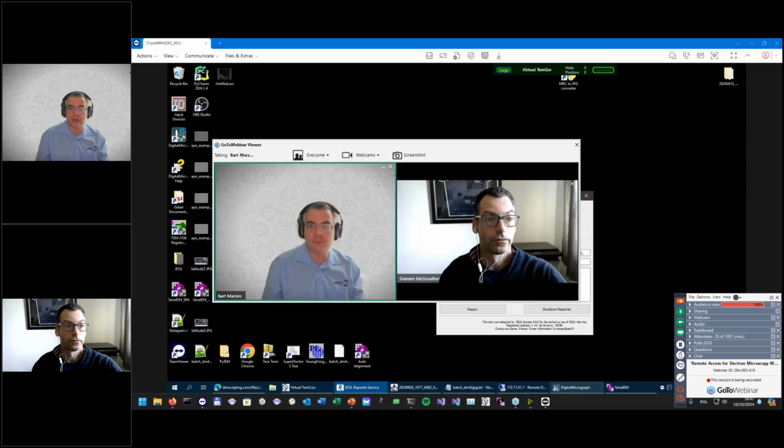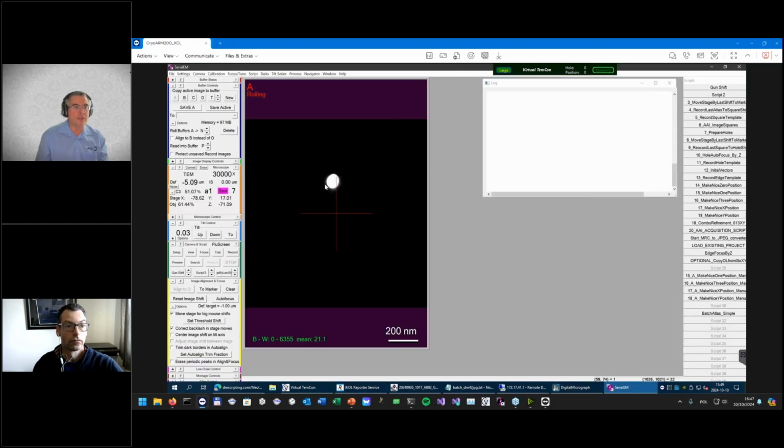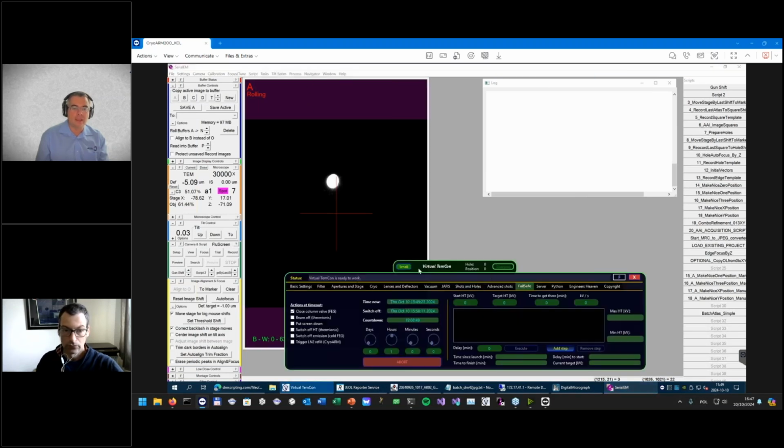Yeah, so as I mentioned during my presentation, Serial EM provides commands that are only a small subset of what's possible with TemExternal, and virtual TemCon can bridge this gap. Let me show you how. So getting back to TeamViewer here, I've got Serial EM running, and I also have here virtual TemCon running.